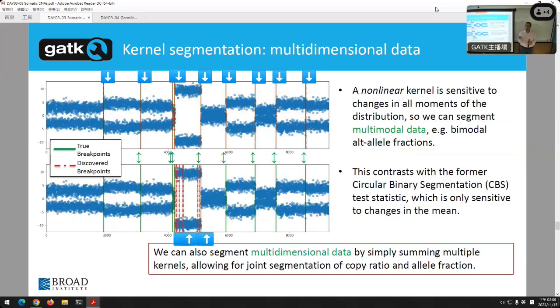And that's what the segmentation is, figuring out where the groups that are together and different are. Make sense? And so that's what we're trying to do here. And I don't need to go into the math or anything. So this is a slide showing that the old way of doing it and the older tools were not great. It was not accurate.